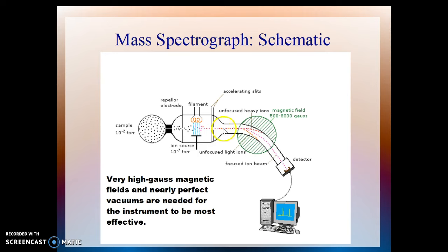And as you can see, a mixture of different colored dots, and therefore a mixture of different massive isotopes, are here. If you think about big cars and little cars racing on a curve, you know the big car finds it harder to turn, and so it's going to be deflected out less than the smaller cars, which will be deflected down. Ultimately, though, you'll get all of the impact of the ions here on the detector. The light ones will be over here on the downfield, and the heavy ones will be up here.